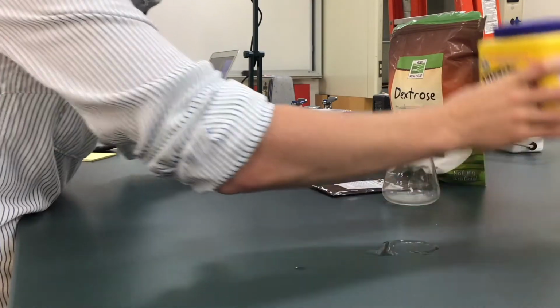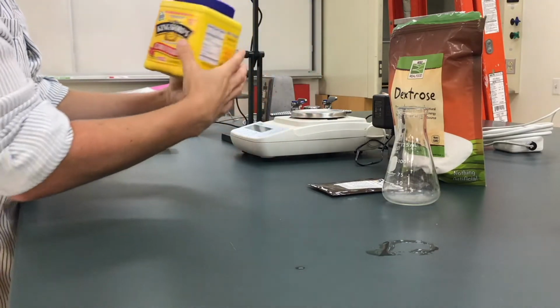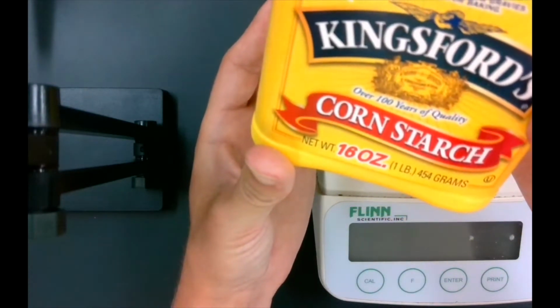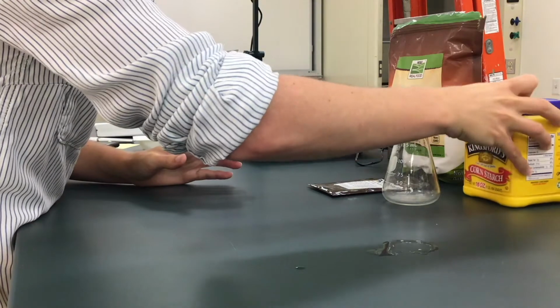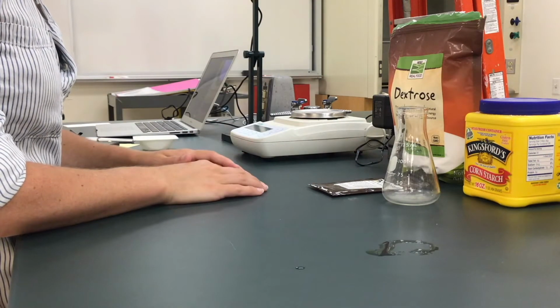We're also going to put starch in our solution. Remember, as you can see, this is something that you buy in the grocery store. It is a more complex carbohydrate, so think about the types of carbohydrates that we are looking at in the solution that's going inside of our dialysis tubing.